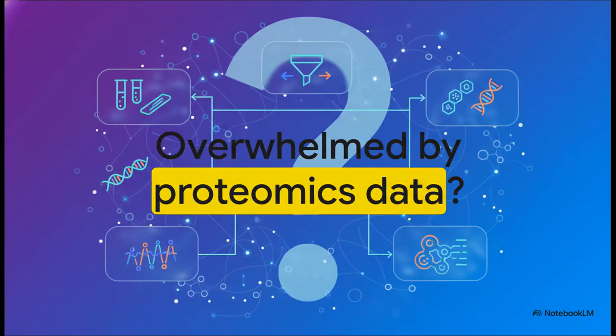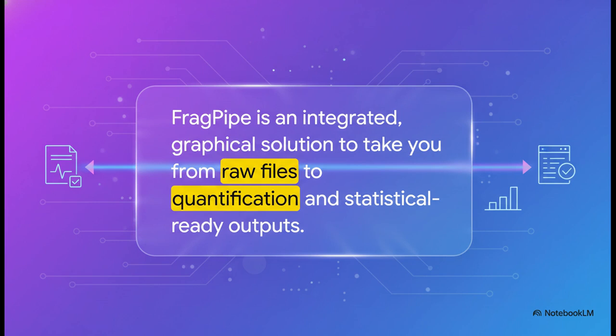You know that feeling, right? You've run all your samples, and now you're just staring at this mountain of complex data. It can feel like a huge leap to get from those raw files to real biological answers. Well, there is a better way.